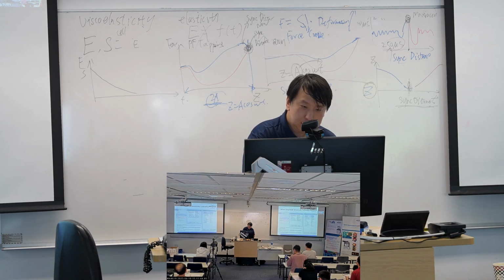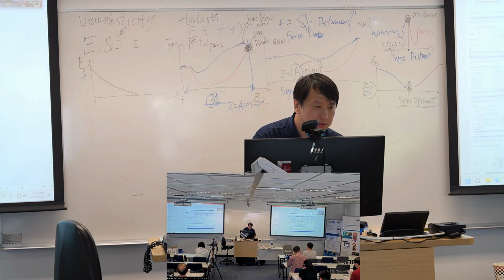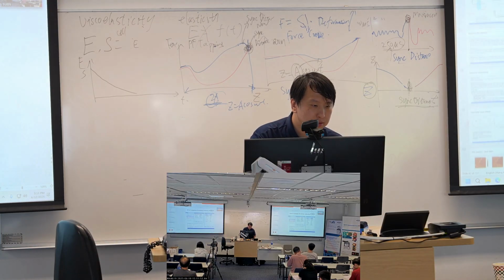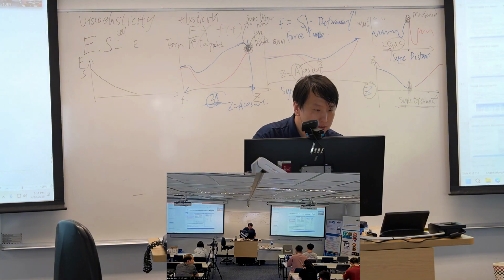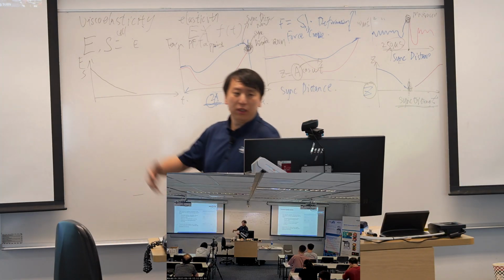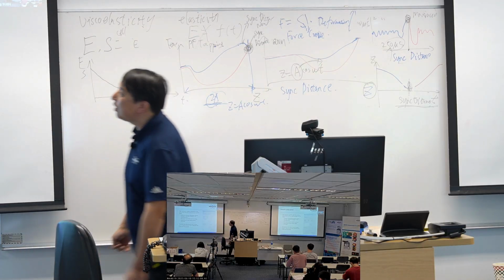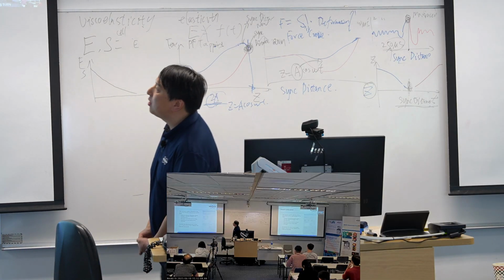In the software sessions, we can have this kind of calibration window. In the calibration window, we will do similar things.